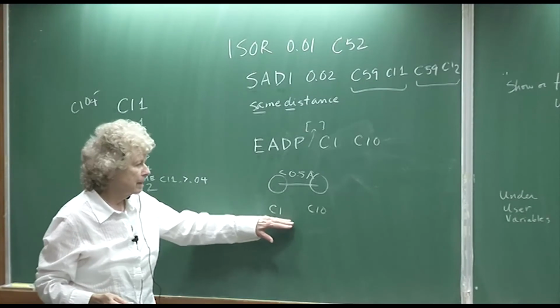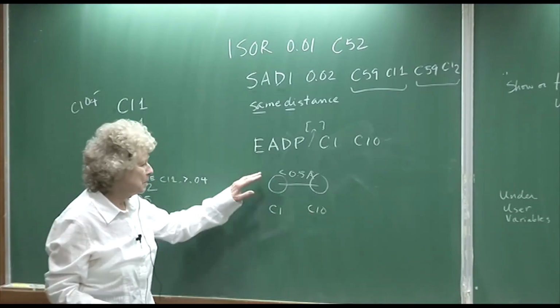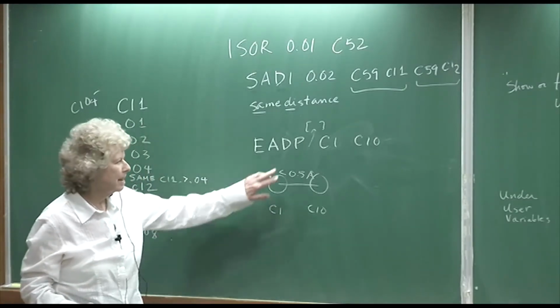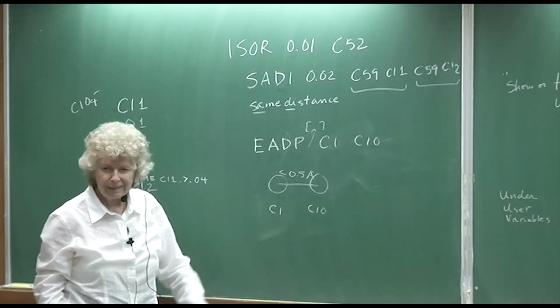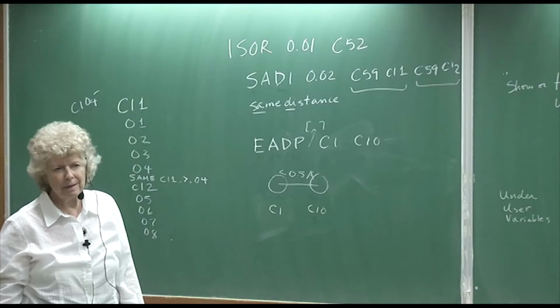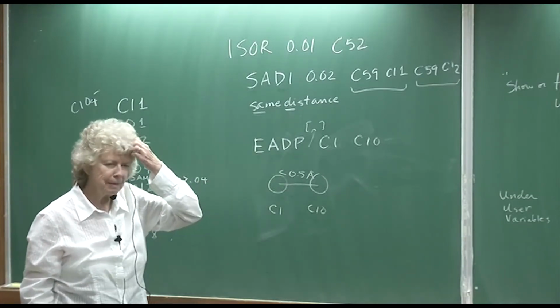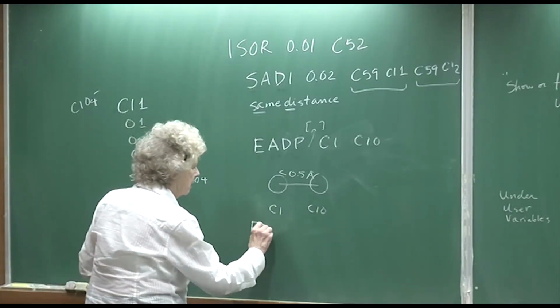It won't work if one of these is anisotropic and the other one is isotropic, though. It only works if they're both isotropic or both anisotropic. And then in the final res file, you'll see that they're actually equal atomic displacement parameters. It has its place. I've definitely used it from time to time. And a similar term is EXYZ.